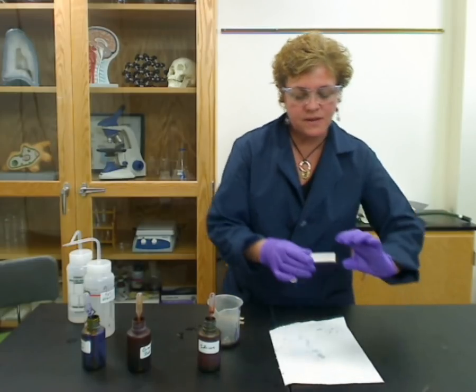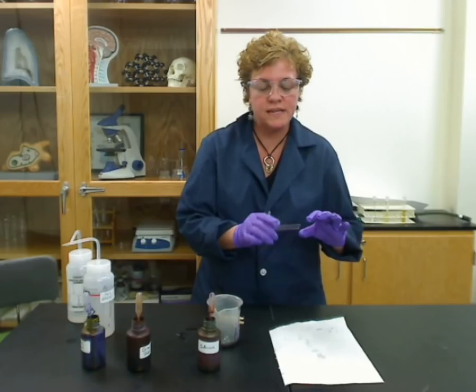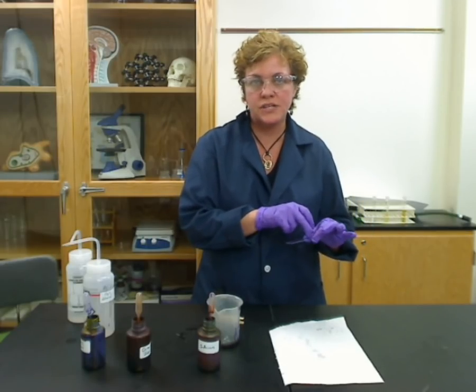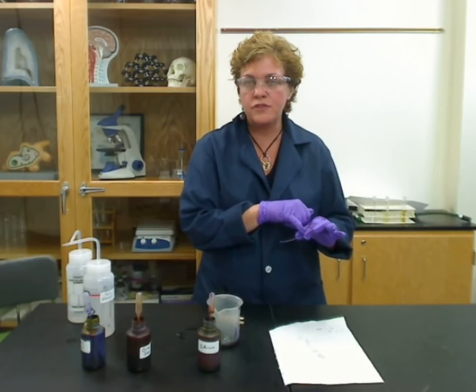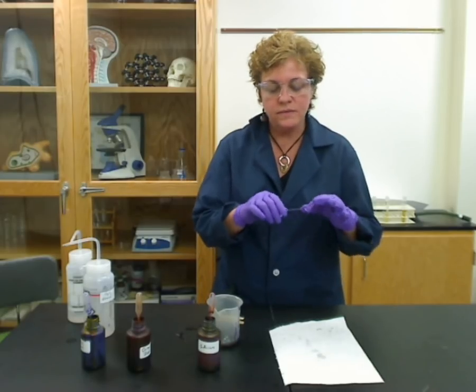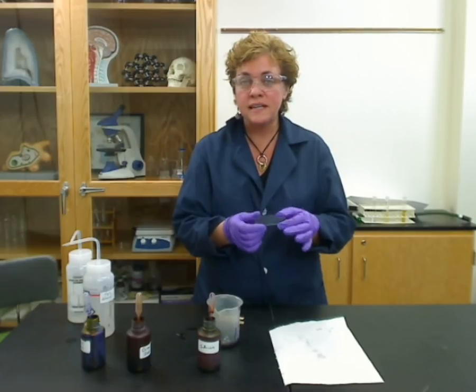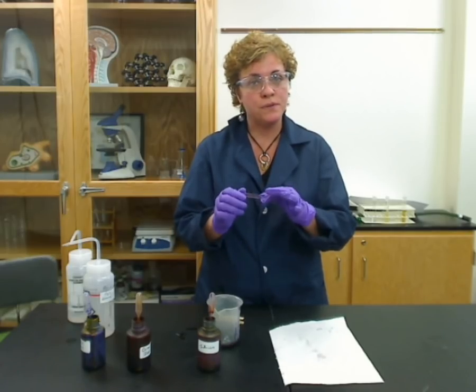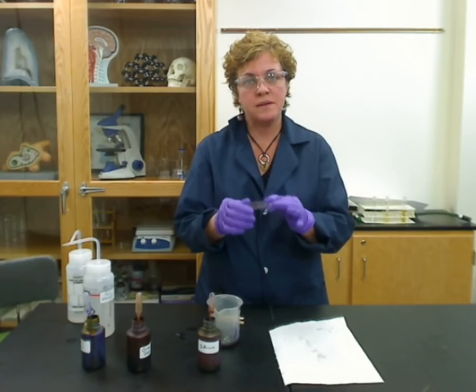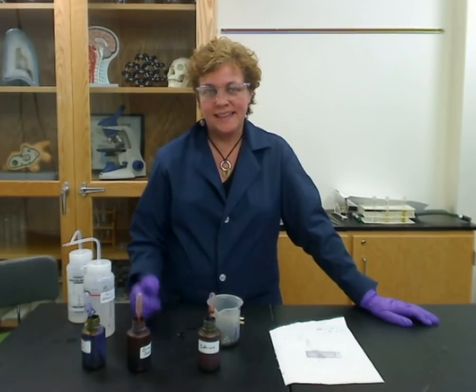Now remember it's face down — how will you know which side is which? The side you've stained is going to be the side that you have the grease marking pencil, the etchings, or however you marked the slide. And once you're done with that, you're done gram staining. You can look and see: if it's purple, it's going to be gram positive, and if it's red, it's going to be gram negative.